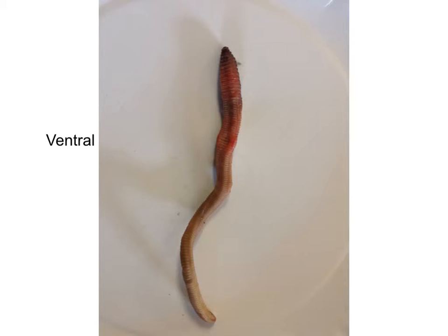Okay, so all I did was flip the worm over onto his back, or his dorsal surface. So right now his ventral surface, or his belly, is showing at us. He's on his back, his belly is facing us, and his belly is his ventral surface. So the mouth is still going to be anterior, and towards the anus is still going to be posterior. So a few things I'd like to point out. This is the interesting side of the worm, I think.